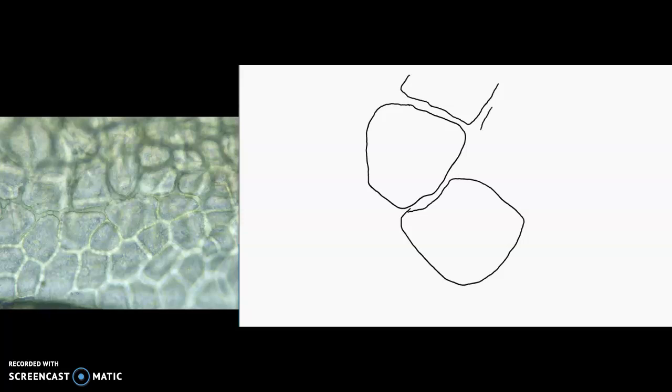That greenish tinted area is the space between cells called the middle lamella. The middle lamella is composed of basically some sticky things to stick your cells together with.